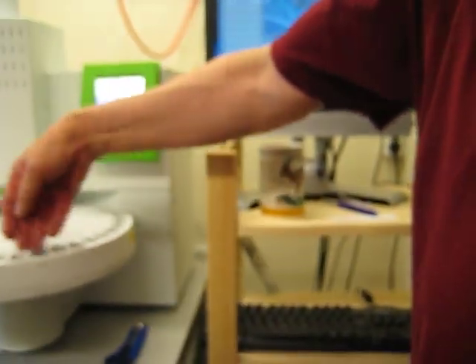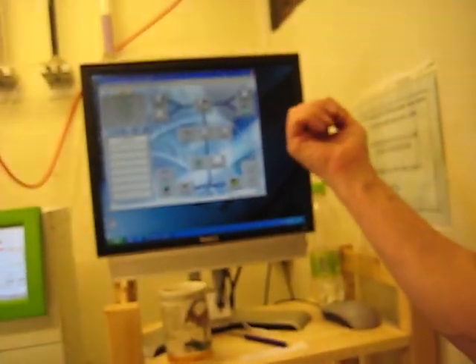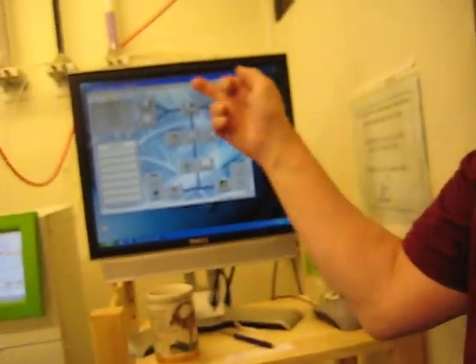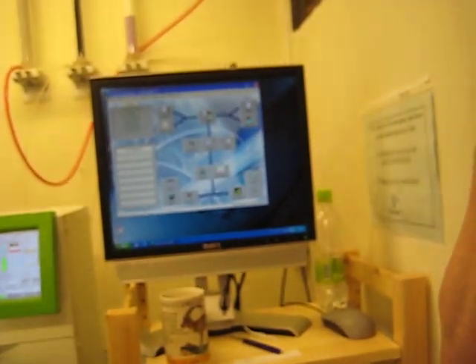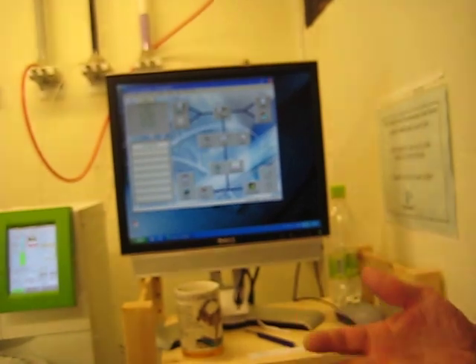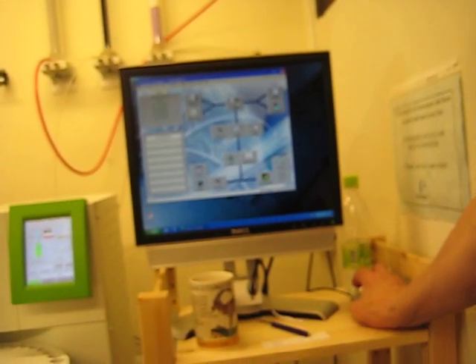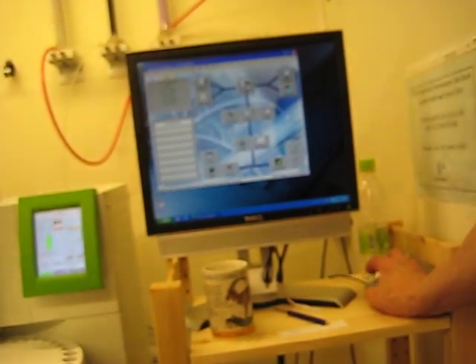Going to analyze more than one sample, we need a sequence. I will always run the whole thing. Yes, and the fact is that even if you are going to use one sample, it creates its own sequence, if you're going from the method this way and not from that way. So it's just as well to start using sequences. But we start by making a method.